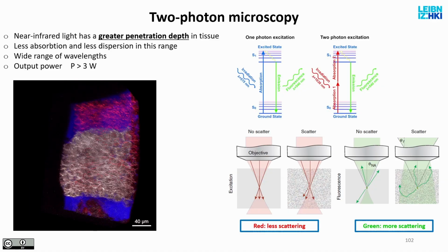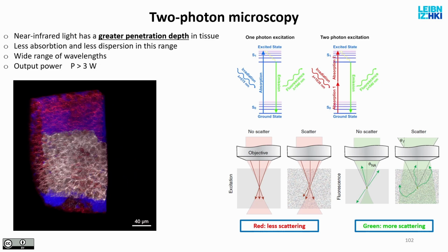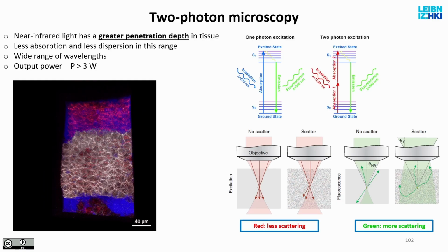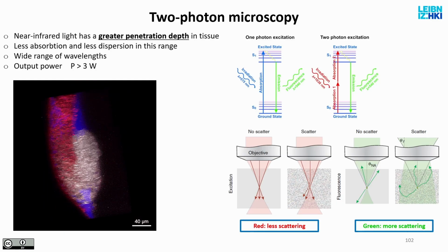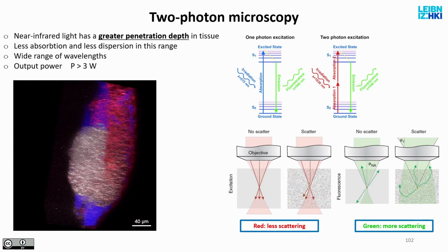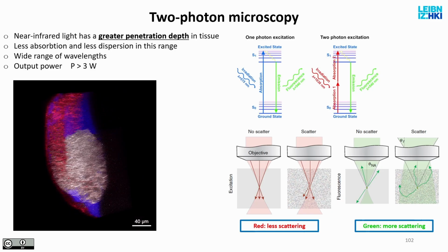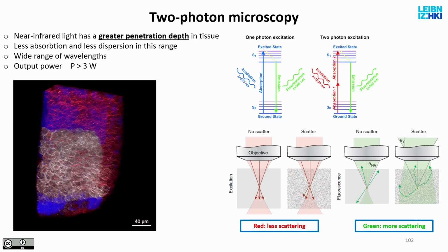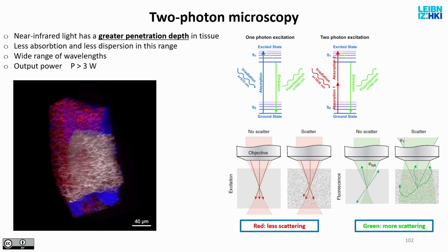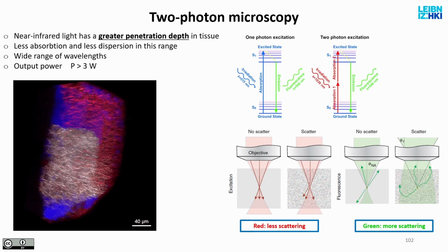Or I can use, for the fluorescent excitation, instead of one photon, two photons. I can say I need one blue photon to excite this molecule, let's say FITC or Alexa 488. What if I have two photons, both red? They would both carry half the energy that I need for the excitation, but I illuminate the sample at the same time with these two photons. The molecule would not care. It would absorb the two photons as it does one. But what is the advantage?